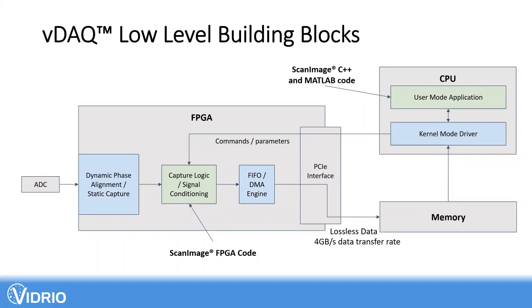And in the ScanImage architecture, not all the frames get processed through MATLAB. So if something needs to operate down to the level of partial frames, it would have to be in C++ or in FPGA. But right now, we don't have access to the C++ portion of the code, right? So if we need to implement something. That's correct.